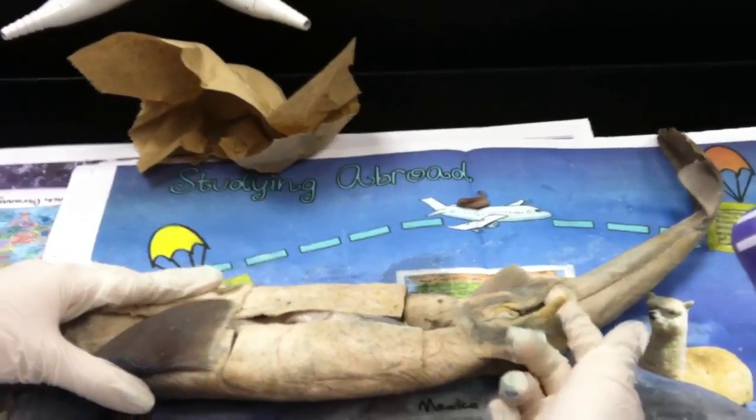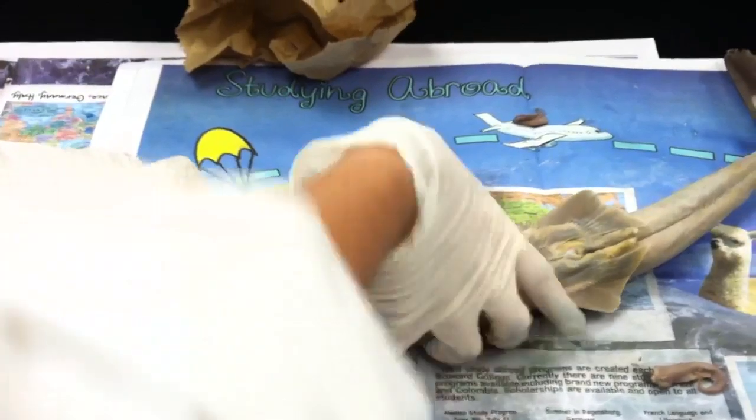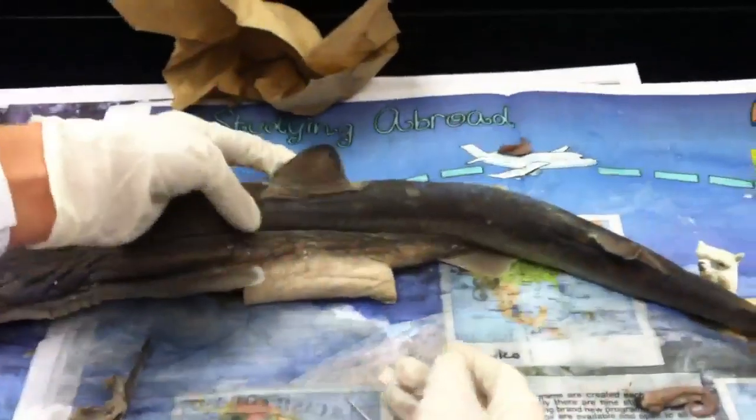That's how you know it's male — these two, you see them? Dorsal fins: this one and this one.